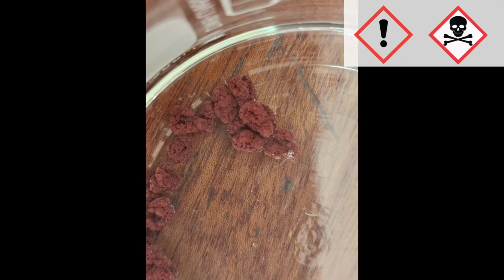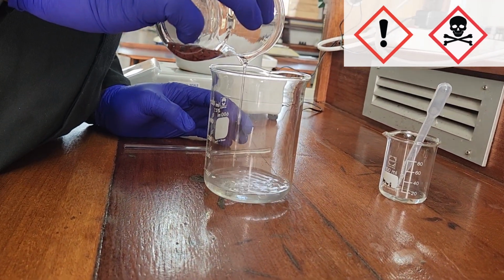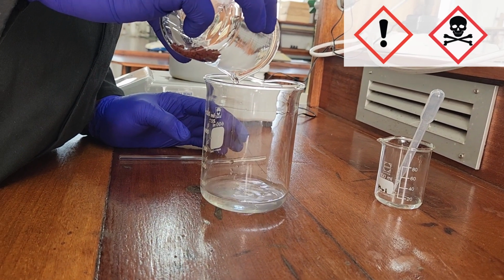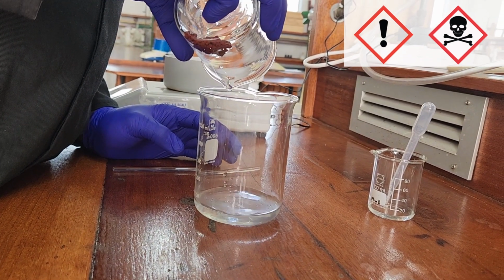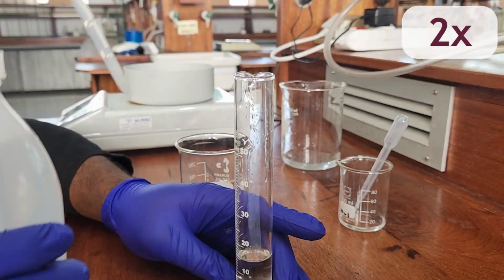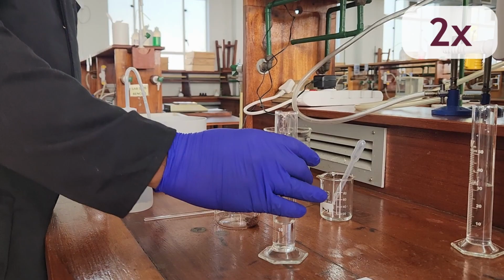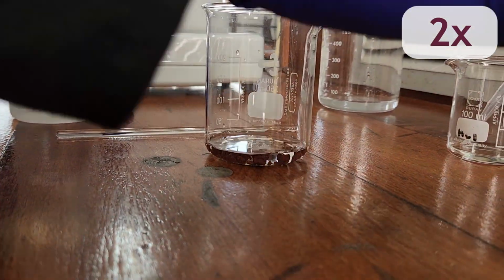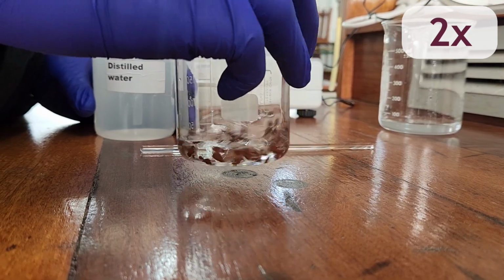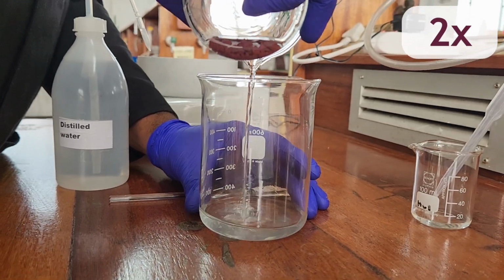Allow the solid copper to settle in both beakers. Carefully decant, pour off the liquid, the solution from each of the beakers into the 600 cubic centimeter glass beaker. Be very careful not to lose any of your precious copper. Wash the copper solid with approximately 15 cubic centimeters of deionized water. Let the copper solid settle again and decant the solution from each beaker again into the 600 cubic centimeter glass beaker. Make sure that you carefully decant as much as possible of the solution without losing any of your precious copper solid. Repeat this step once more.